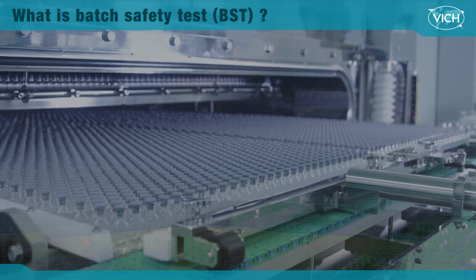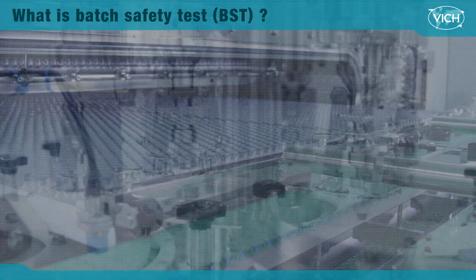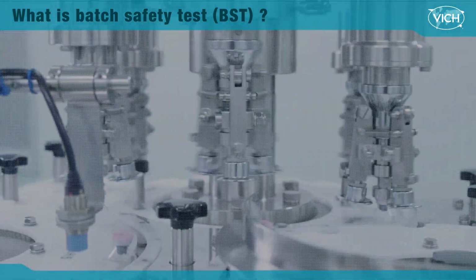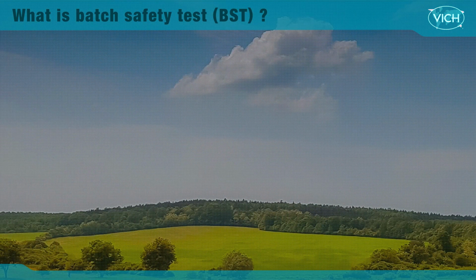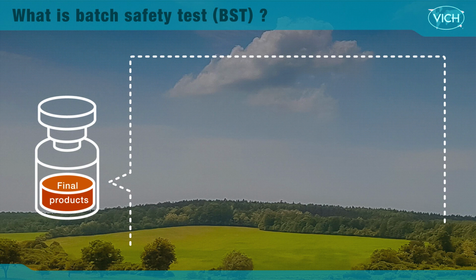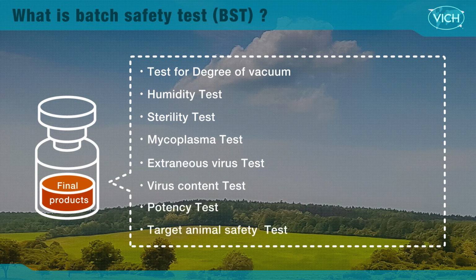As shown above, vaccines are usually made using raw materials and incubation technology, so numerous quality control tests have to be carried out on every batch of the final product. Shown here are the tests that are normally carried out on the Newcastle disease vaccine, which we chose as our example earlier. They include safety tests on the chicken, which is the target animal. This test is known as a batch safety test, or BST.